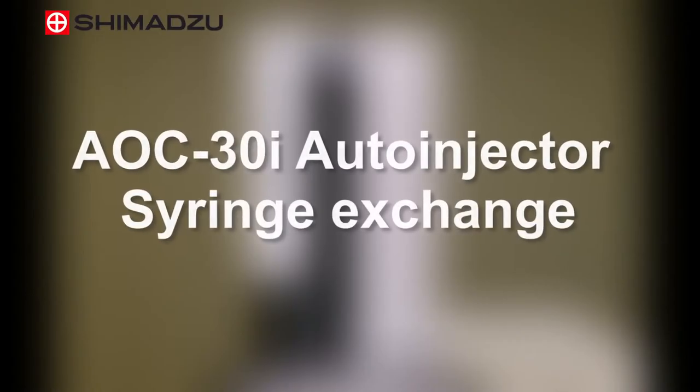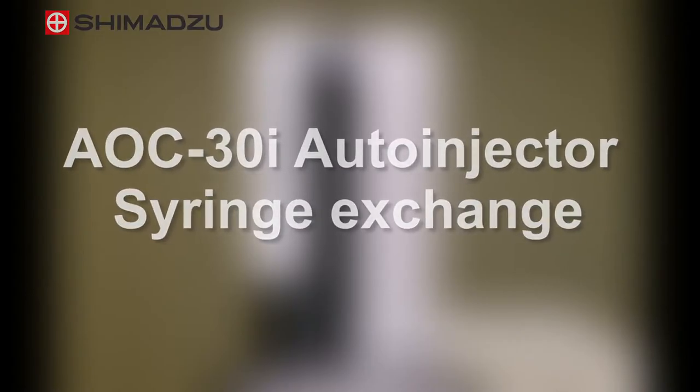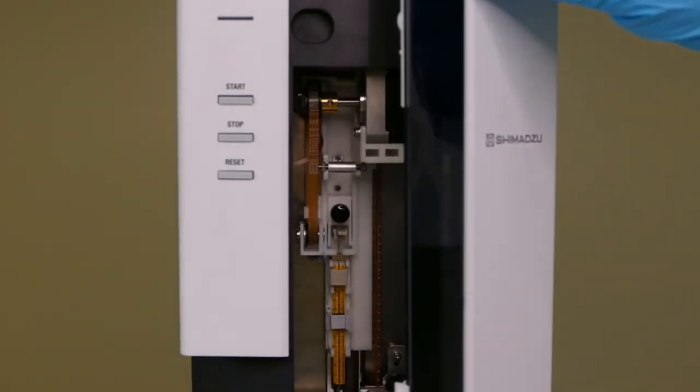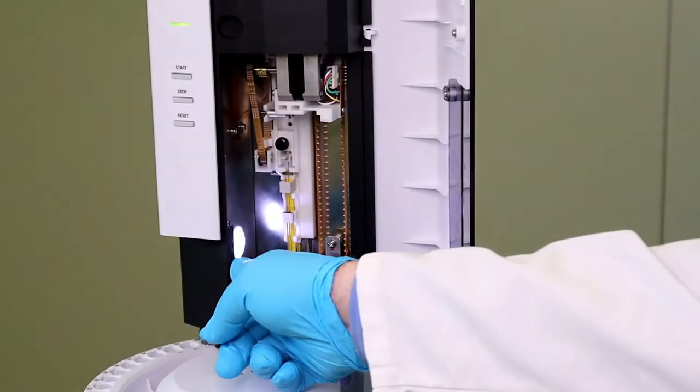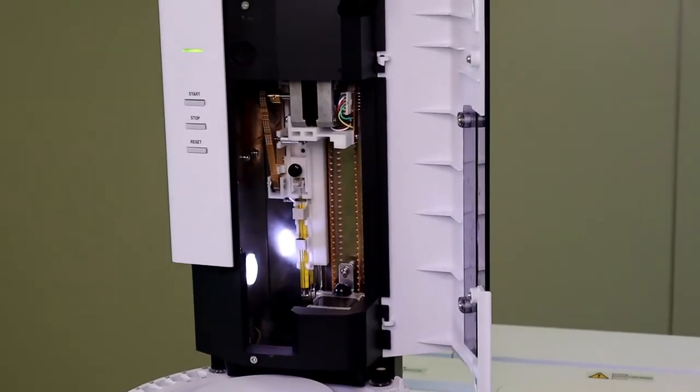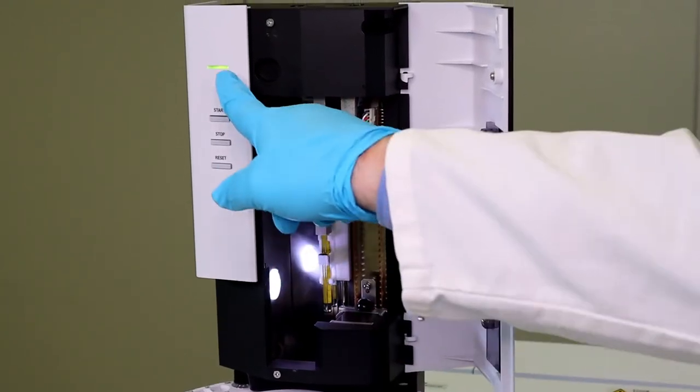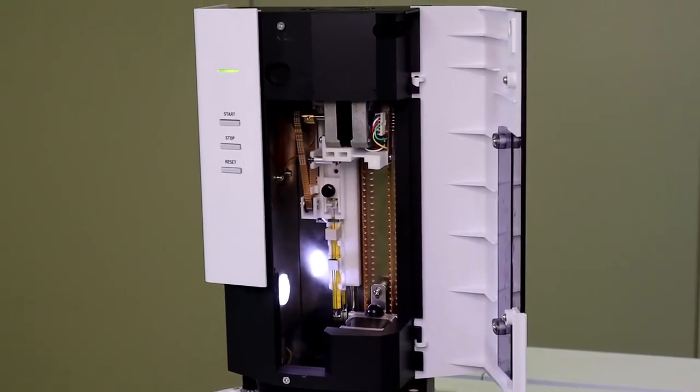The AOC30i auto-injector can operate liquid syringes within volumes of 0.5 to 250 microlitres. When opening the front door for syringe exchange, the injector light switches on and shows the installed syringe.